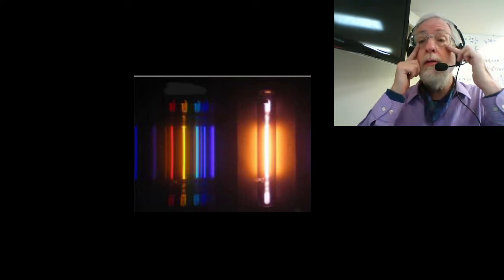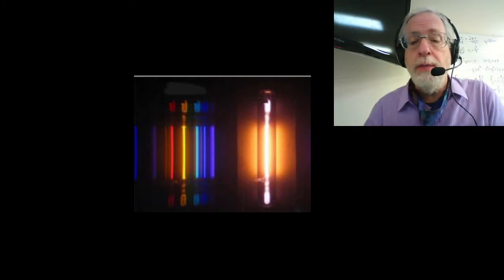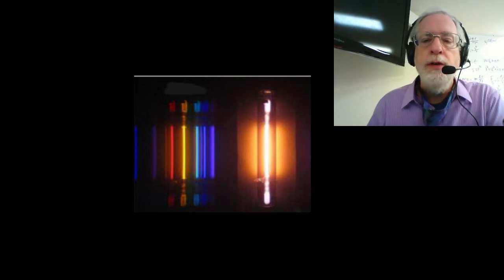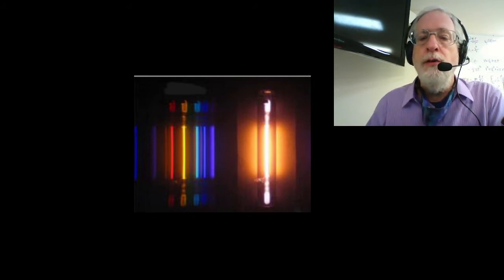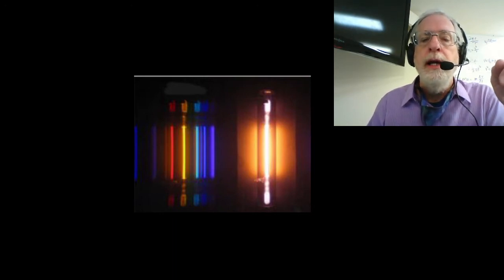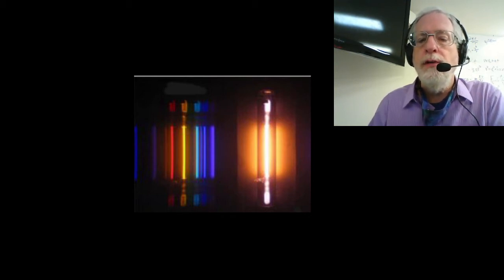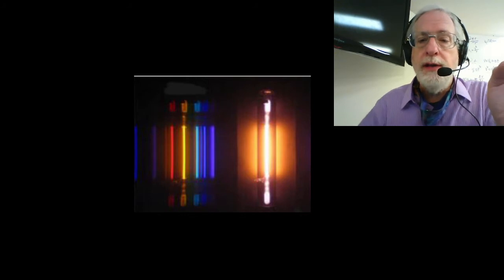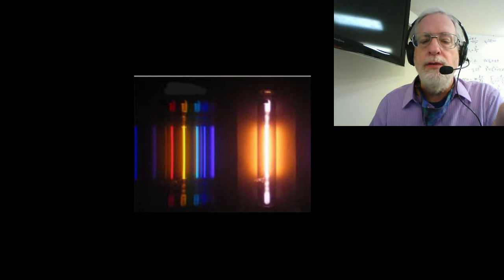It's a little bit overexposed. Normally it's kind of an orange to a red orange that is usually the color that you see. And you can see on the left that there is a red and an orangey yellow there and a few blues and a purple that come out when you separate all of these colors. So that's helium. And that's literally all we're doing in this lab, describing colors. You can pause this video whenever you need in order to write these colors down.